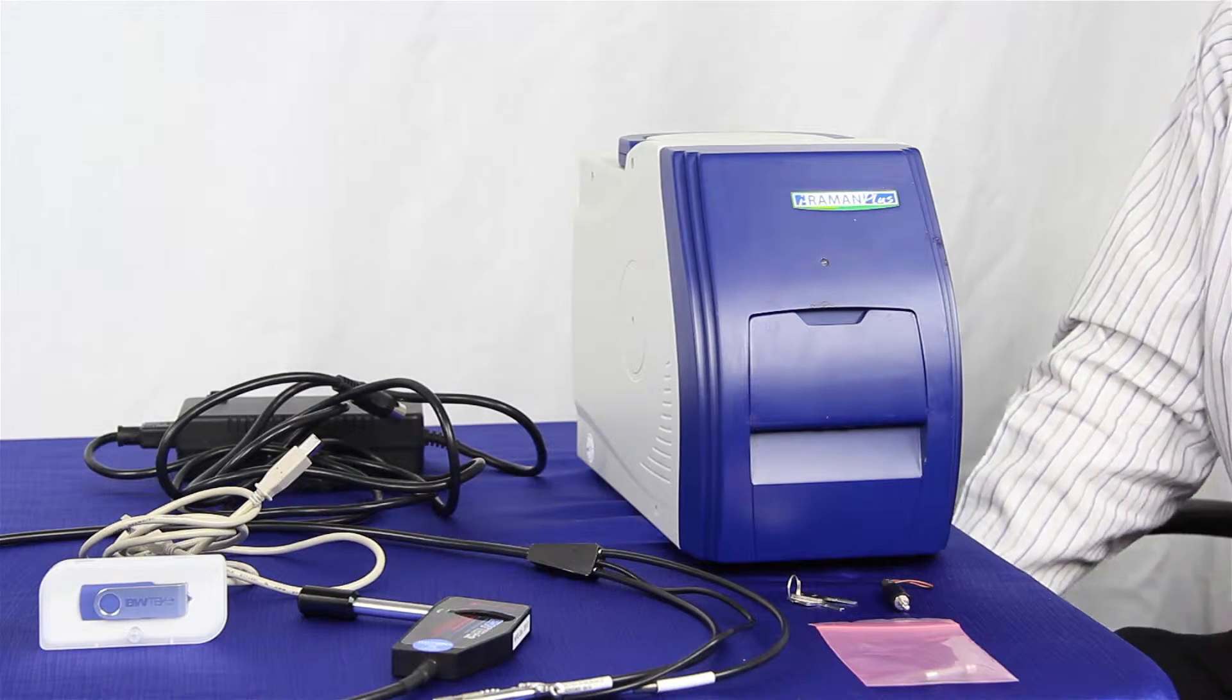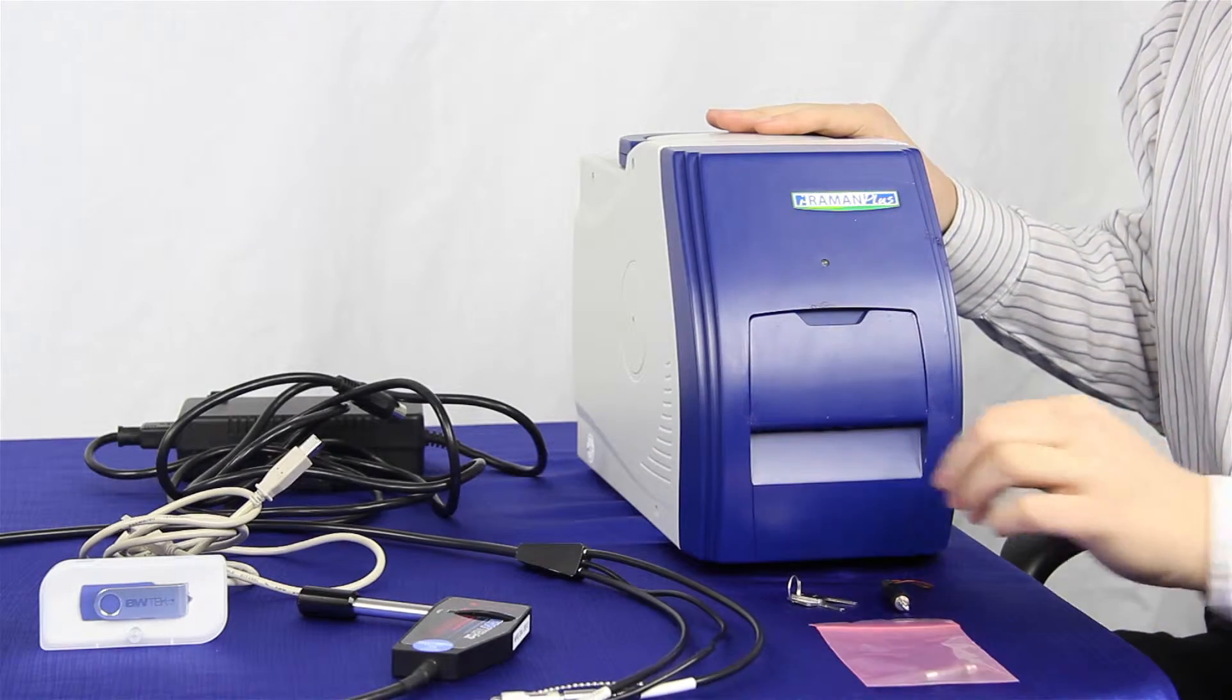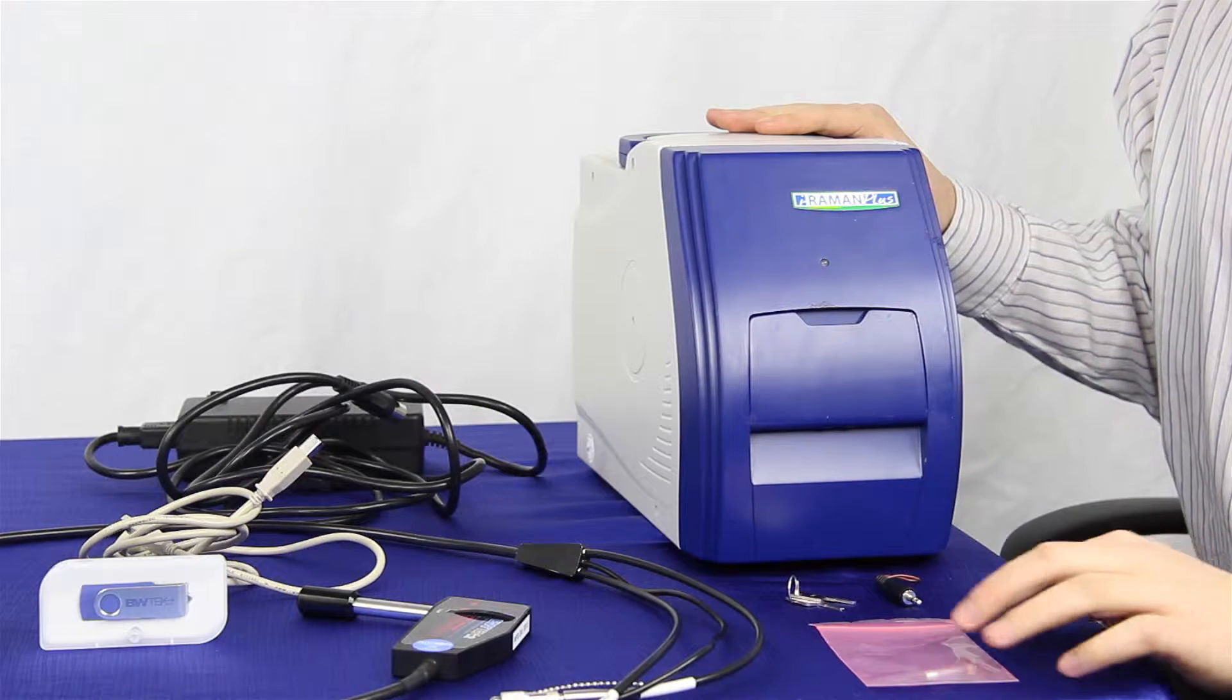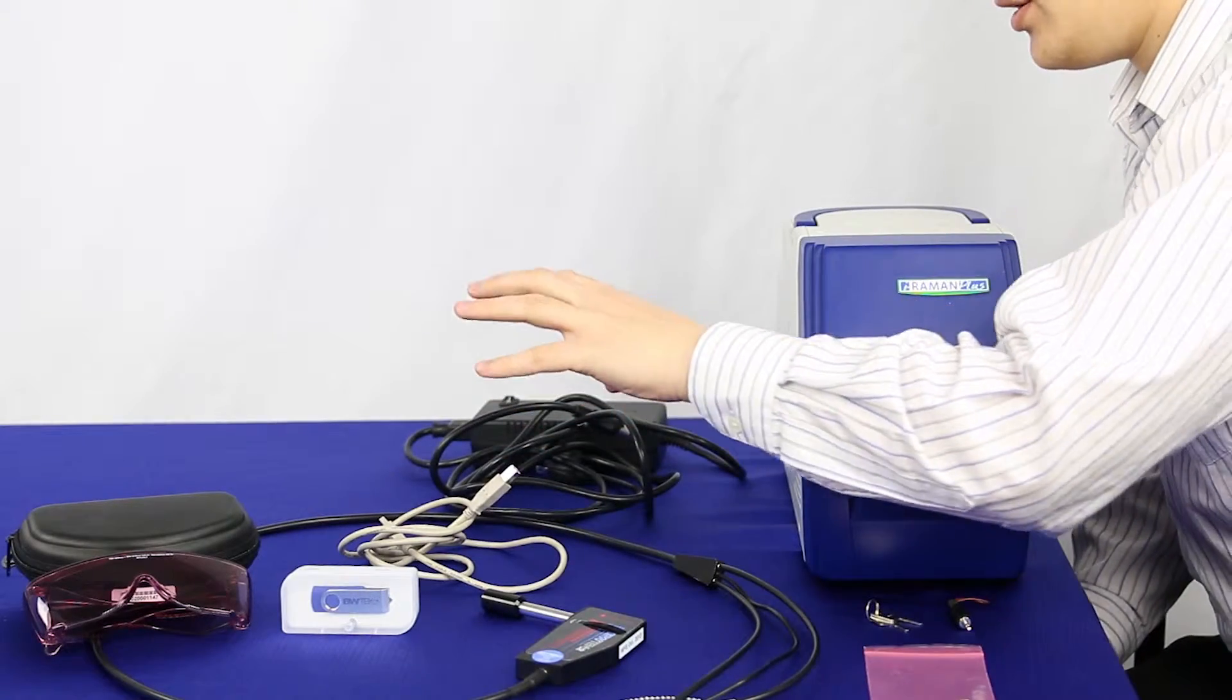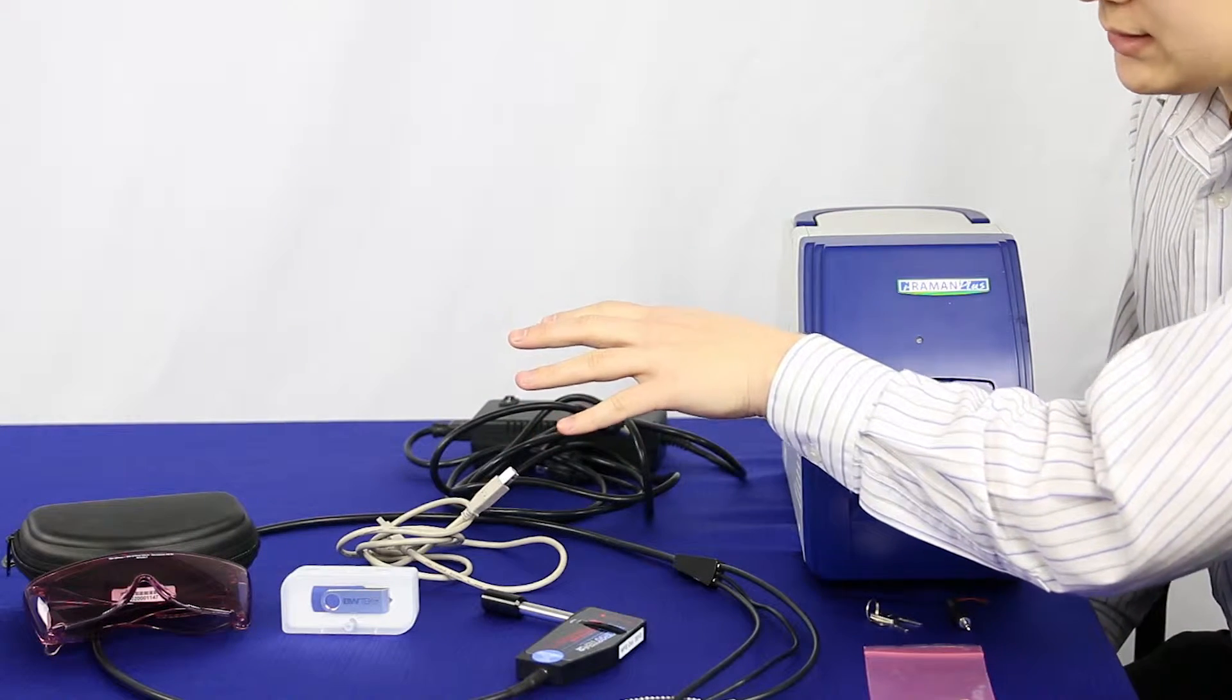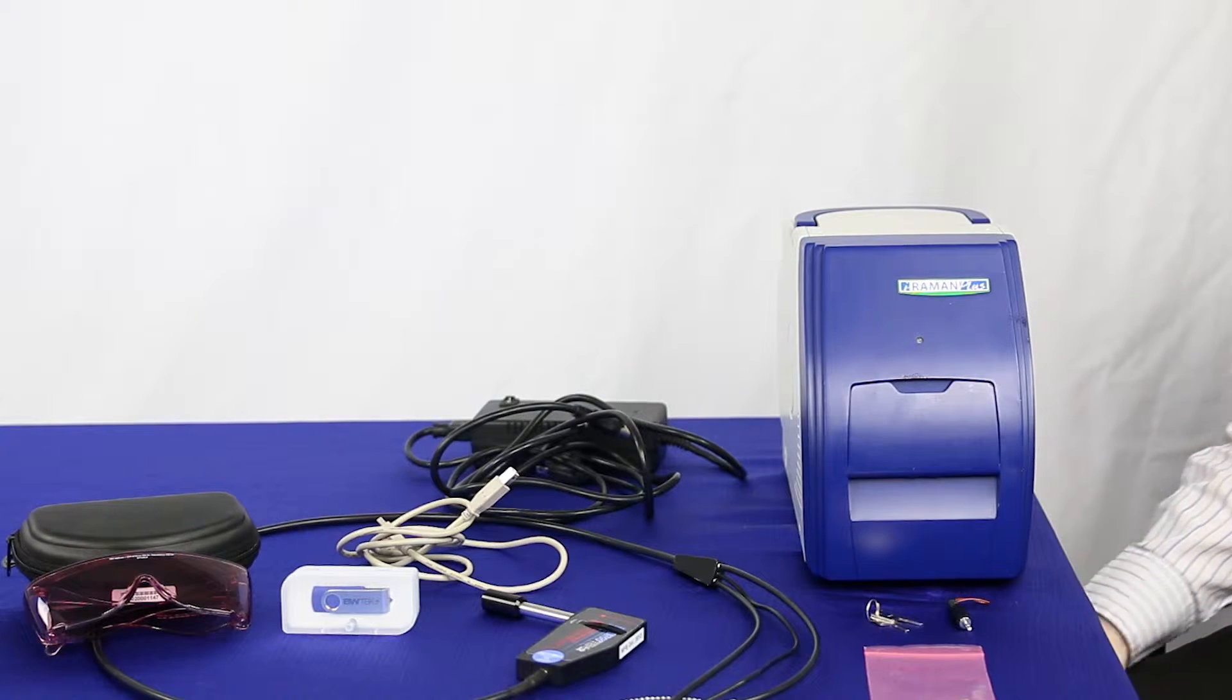Anytime you receive an iRamen Plus, you're going to receive the unit itself, your Raman probe, laser keys, an interlock, a fuse, an extra fuse, a power supply, USB cords, laser safety glasses, and a USB containing all the proper documentation and software that you need.